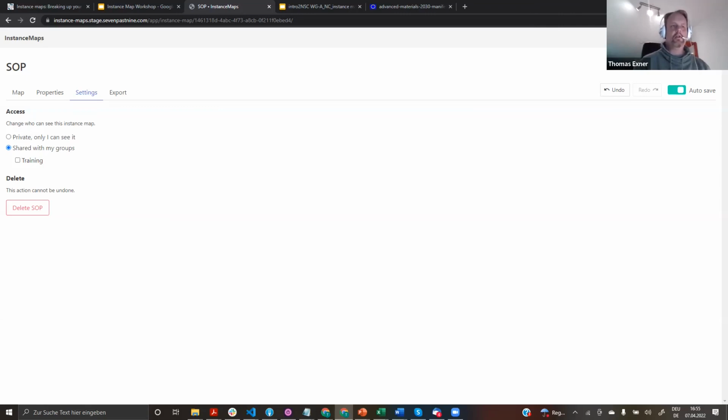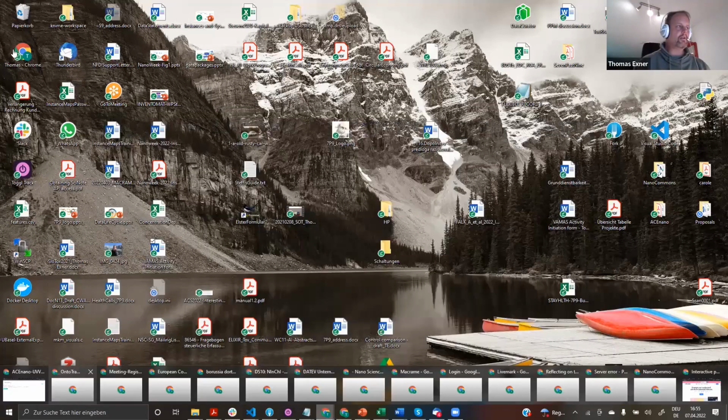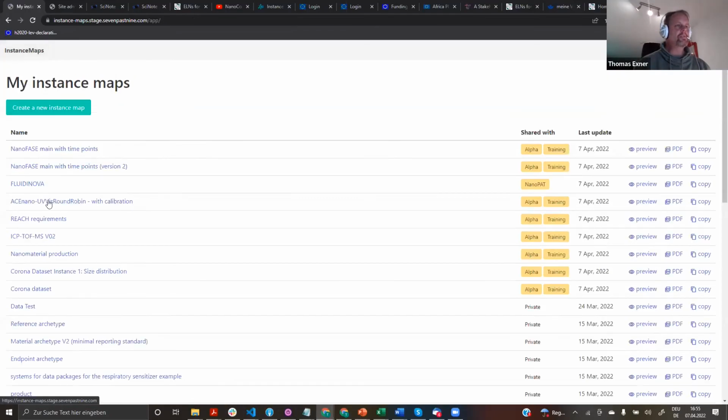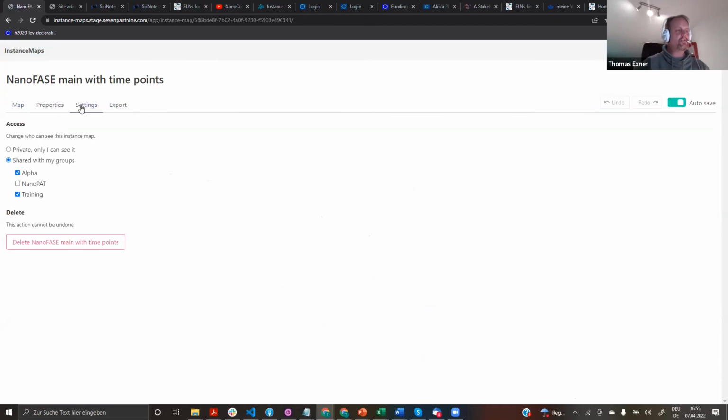This is more interesting if you look at the other one, because there I'm in many groups. If I'm here, then I can really share that now with, where do I have it in settings? I can share that with my alpha testing team, the training team, and I already prepared another project group where we will discuss some other things.